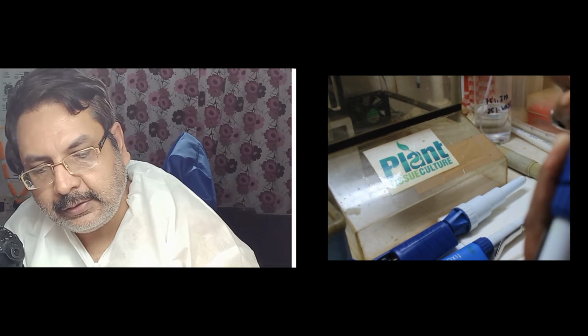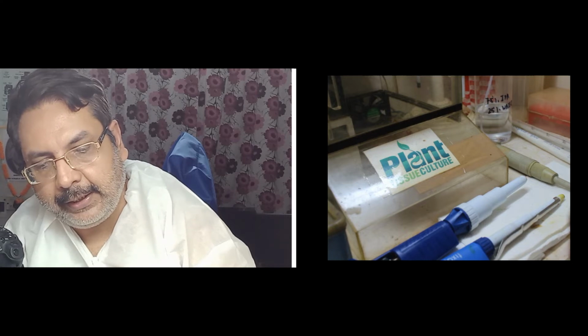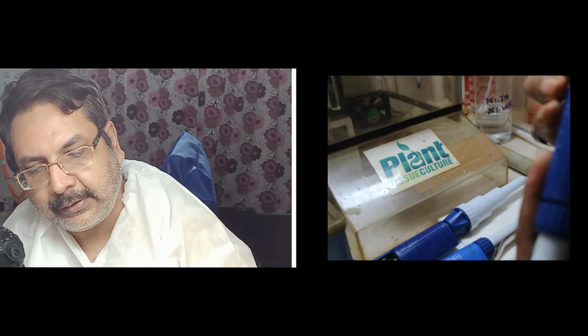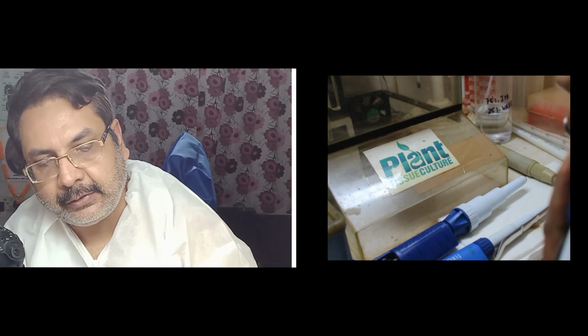So now this is 1000 microliter. Now we are getting 500 microliter. This is 900 microliter. Like that you can set. So now we are going towards 800 microliter. Now this is 700 microliter. Like that you can set.